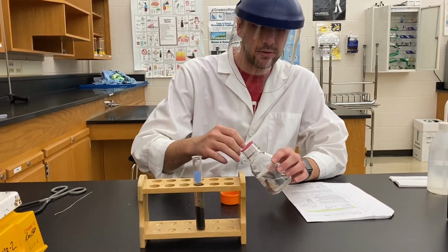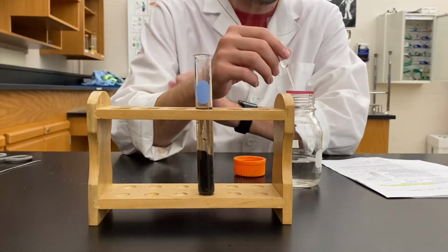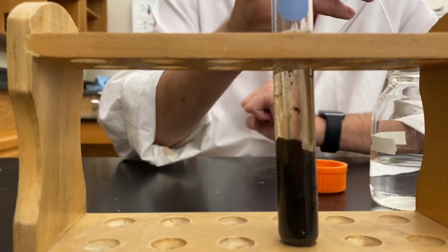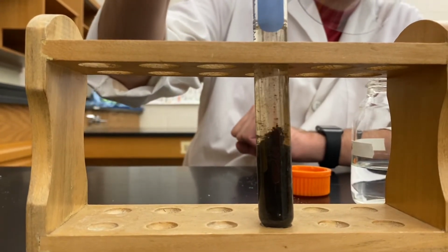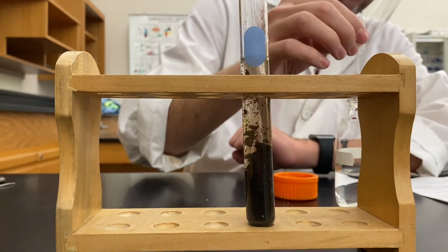Our pipette again. So this is our solution of hydrochloric acid. I'm adding it to the copper 2 oxide and water, and the result of this reaction is going to be copper 2 chloride and water. Do another squirt here.